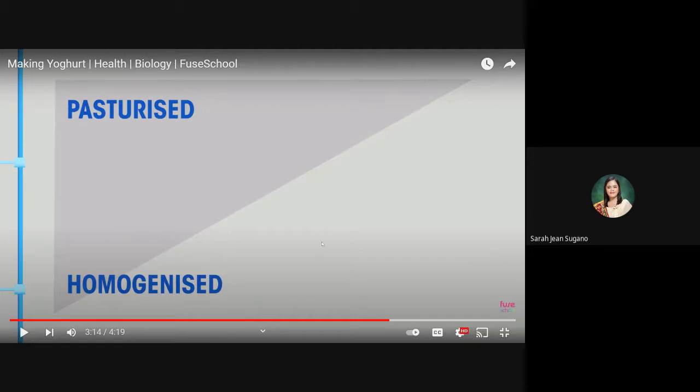When we obtain milk from the farm, there are lots of bacteria that will grow after an hour, after 12 hours, if we will not pasteurize it. Okay, that is why it is part of the aseptic technique in the yogurt fermentation that you have to pasteurize your milk, to kill the unwanted bacteria.